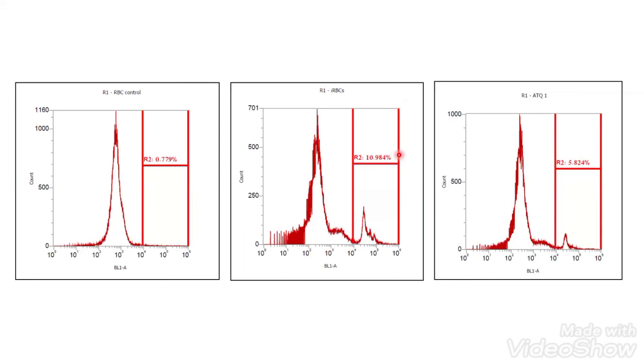So yes, but for that we would like to have information about what bacteria you are talking about and what their DNA content is. So we have to optimize the system, whether we can separate them based on their DNA content or based on a particular marker.